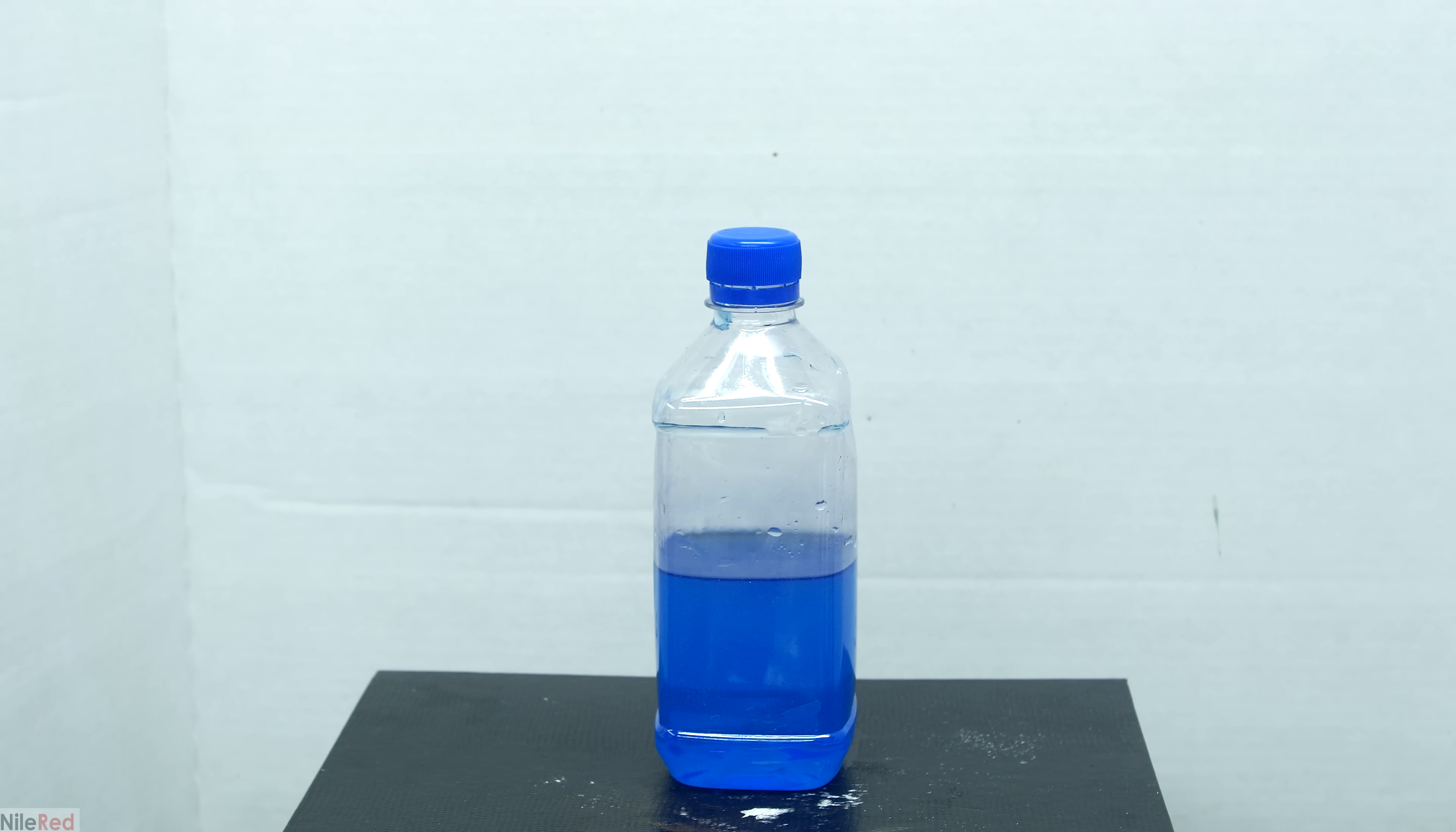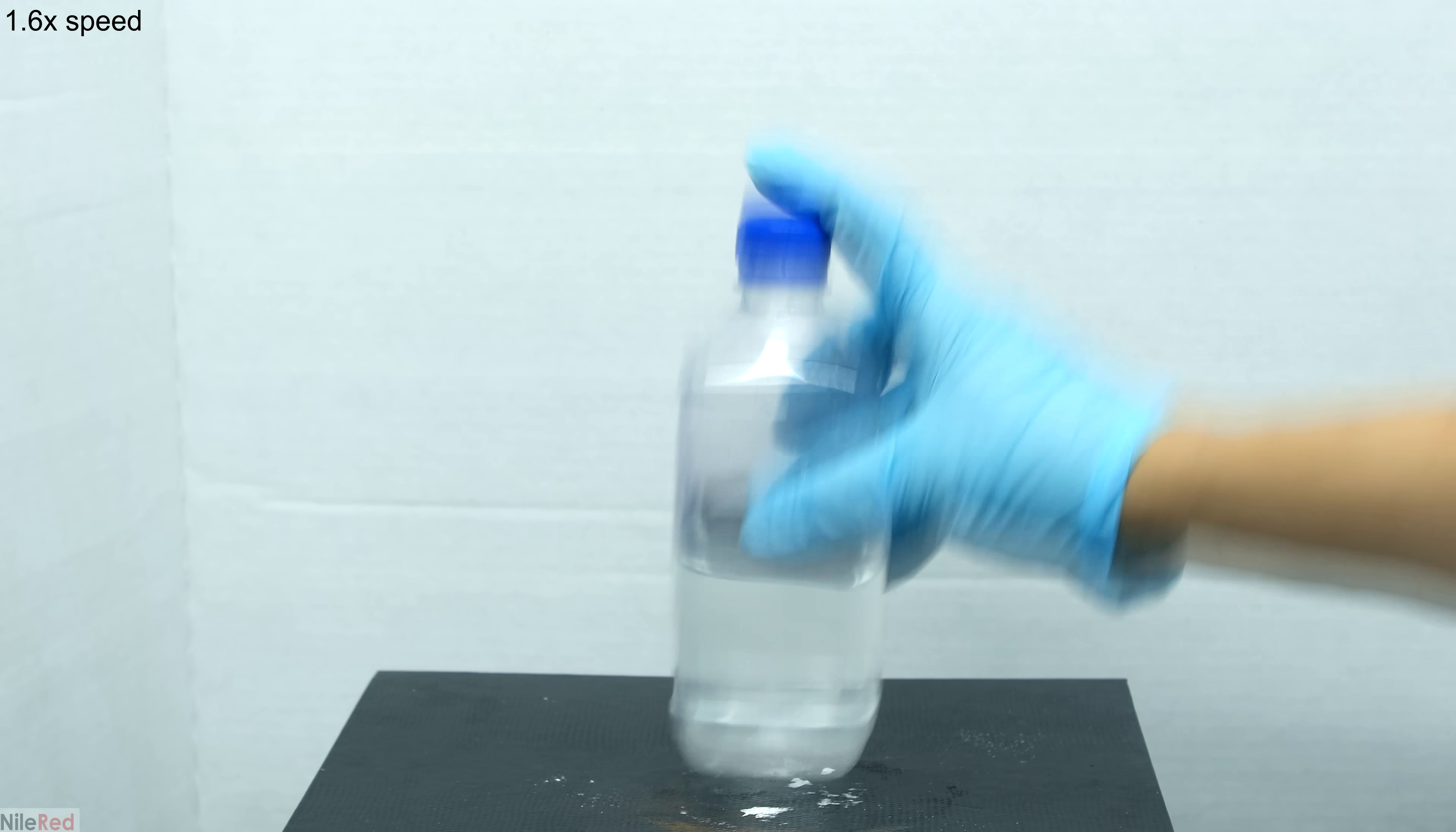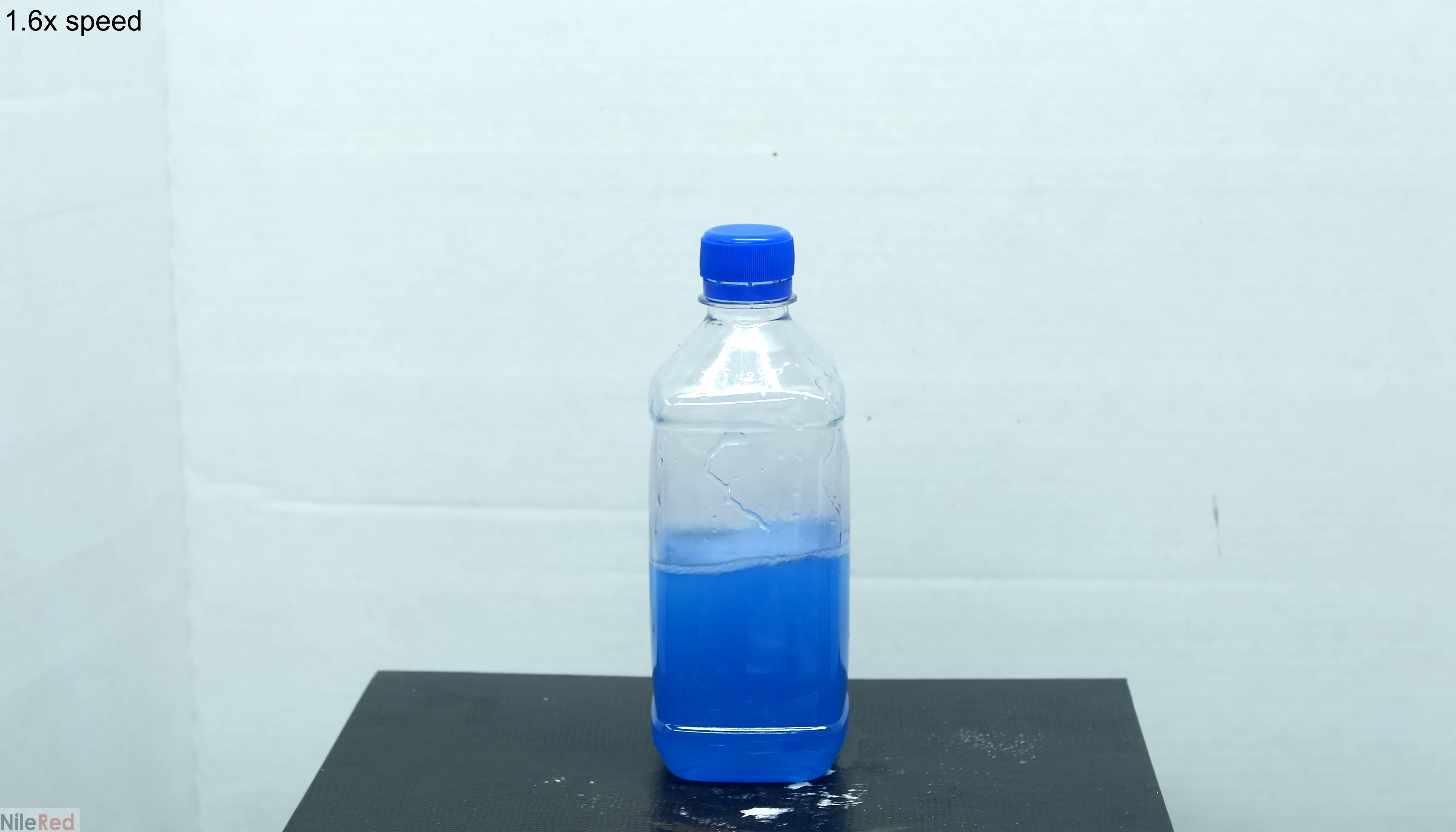As we let the container sit here for a little bit the blue color starts to fade and we're left with a colorless solution again. The cycle of shaking the bottle to make it turn blue and then waiting for it to revert back to colorless can be repeated several times. So this obviously isn't magic and we're going to talk a little bit about what's going on here.